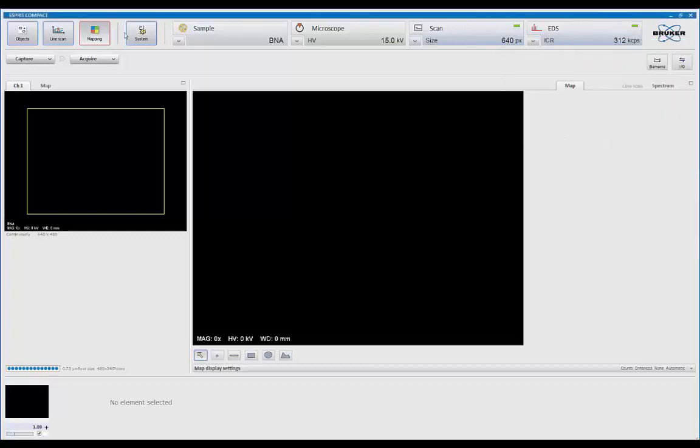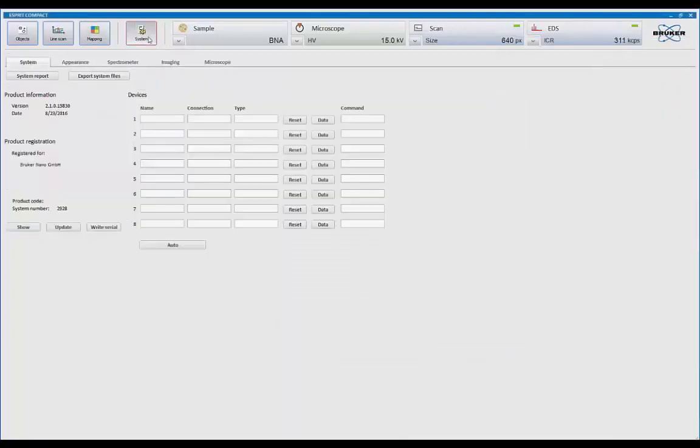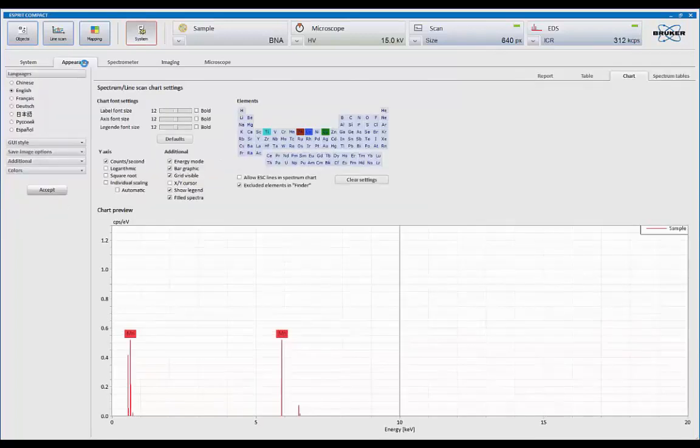Now, system is for the communications of the hardware. This is where we go and set the defaults. The service engineer will come in here and set that for you.